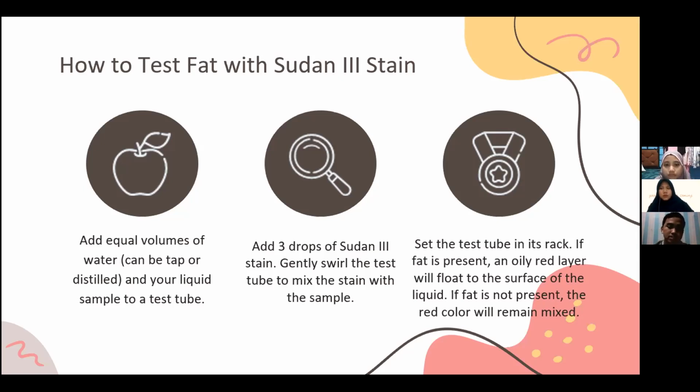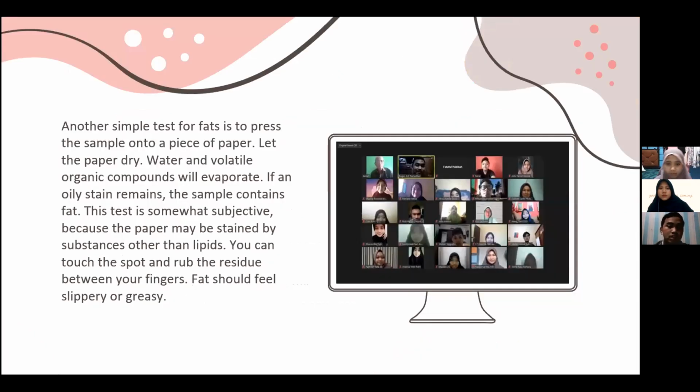If fat is present, an oily red layer will float to the surface of the liquid. If fat is not present, the red color will remain mixed. This is the simple test for fats.